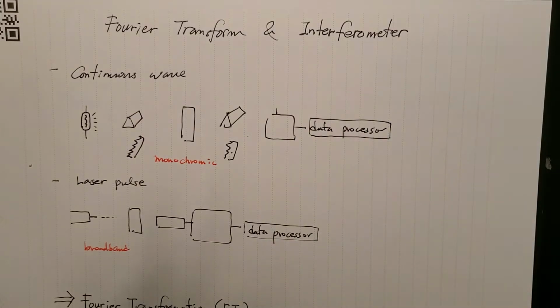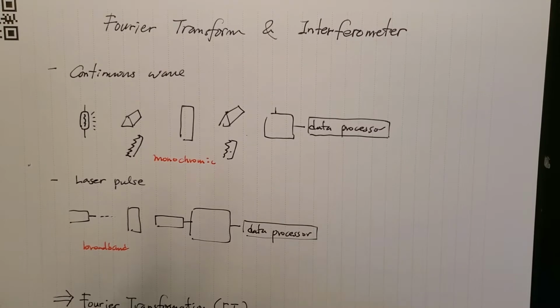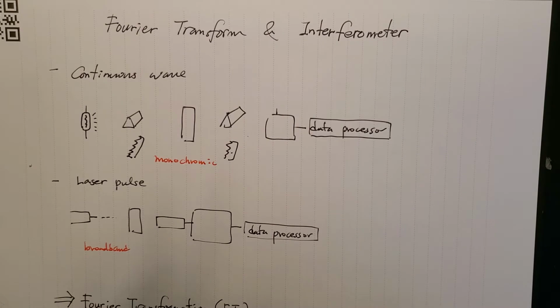In this video, my goal is to give you a really brief foundational discussion about Fourier transformation and the interferometer. These equipment and techniques became really useful for all kinds of spectroscopy. Some of the main benefits could be the operation time for you to get the data.